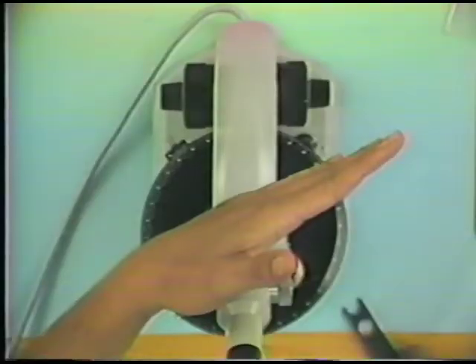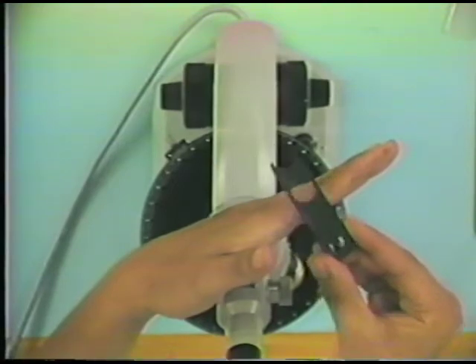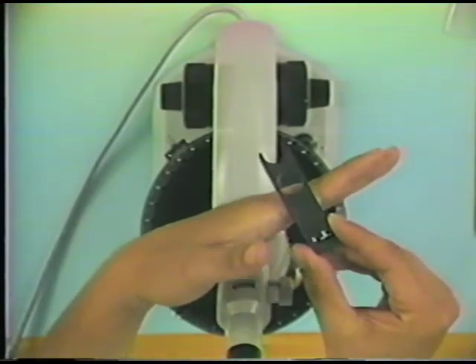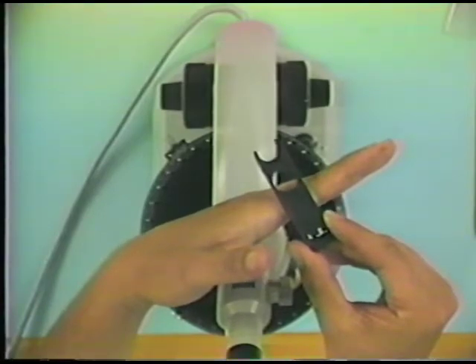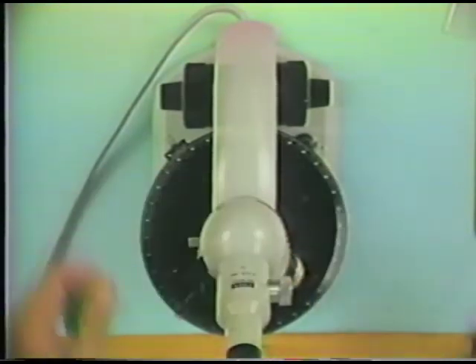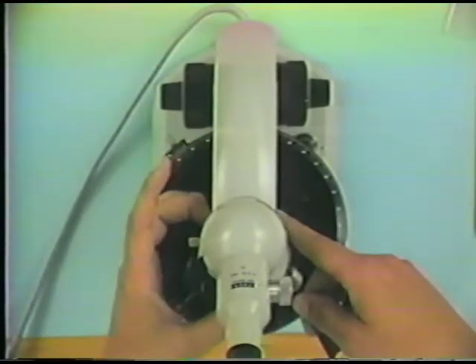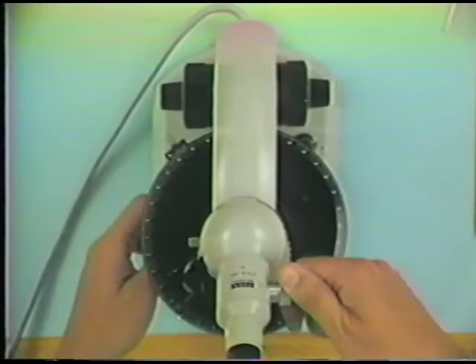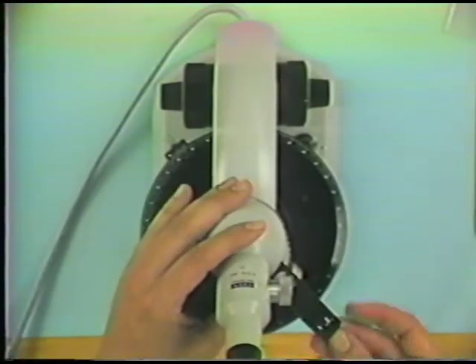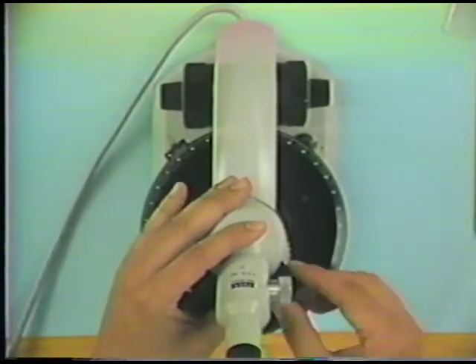use the accessory plate then to determine whether the slow ray in the accessory plate is parallel to the slow ray in the mineral melilite, or whether it's parallel to the fast ray. And the way we test that then is to look at the mineral simply in cross-polarized light, take out the Bertrand lens, take out the converging lens, insert the accessory plate like this, and watch the change in color.